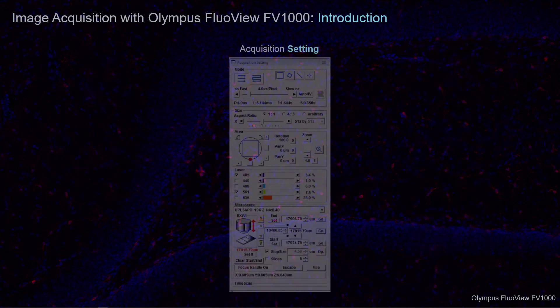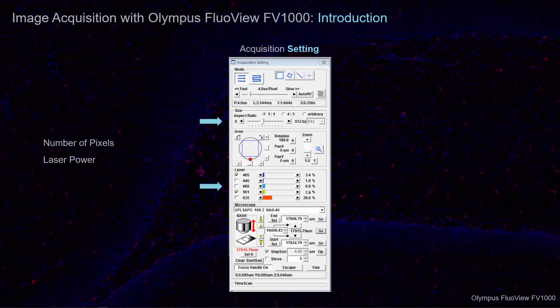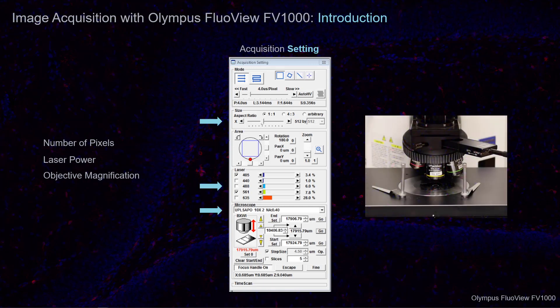In the Acquisition Setting window, we will primarily be making adjustments to the number of pixels in the Size menu, the Transmission slider for the output power of the lasers in use, and the Microscope menu. Here, you can select from a drop-down list of objective magnification presets. It is essential that this selection corresponds with the lens in use on the microscope's objective turret.